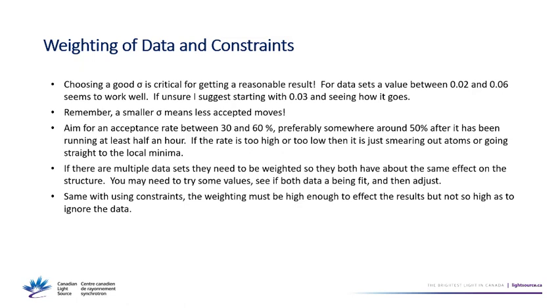It's also worth noting that as the calculation proceeds, you may have to adjust the weights. Yes. Because your initial models might fit one kind of data set pretty well, and do a terrible job on one of the other ones. And as it proceeds, the bad one will tend to get better. And so at that point, you may want to reduce its weight so that it's not still overwhelming the other one. That kind of thing. You have to sort of keep balancing them out as time goes on.